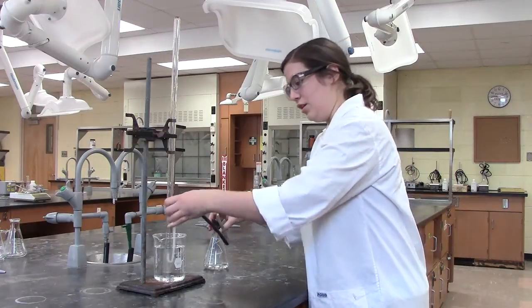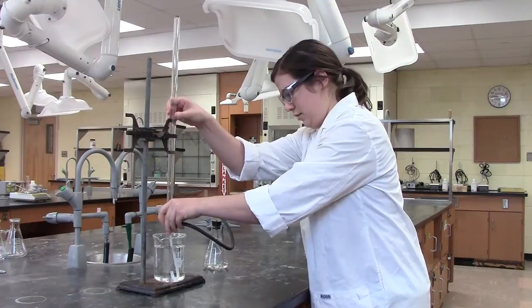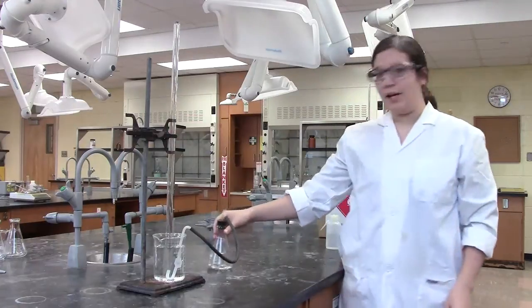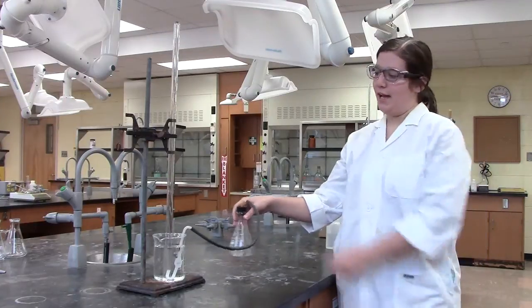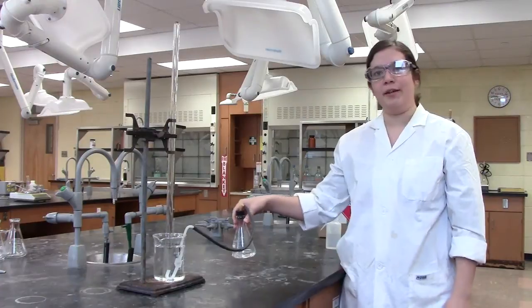And then put the U-tube underneath the gas buret. And then press it down at the bottom to hold it steady. When you're ready for the reaction to start, knock over the vial on the inside of your Erlenmeyer flask and swirl to mix your solutions. As gas starts to form, it will bubble up into your gas buret and the volume can be read.